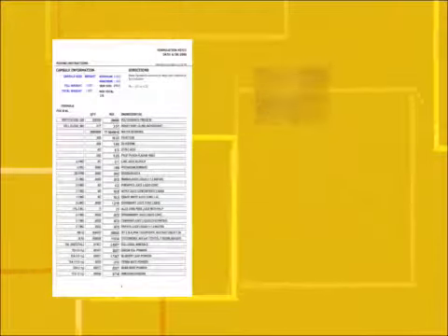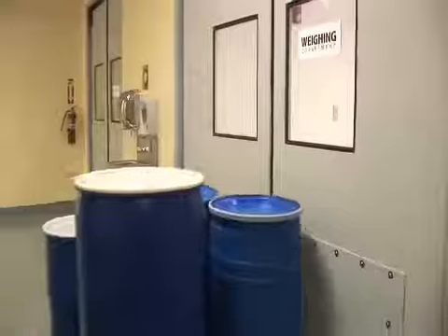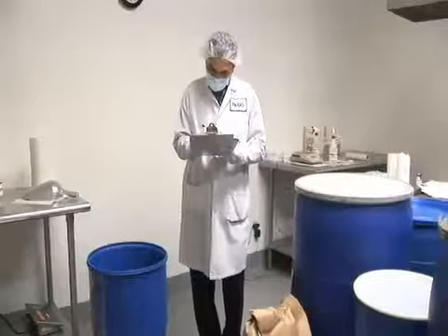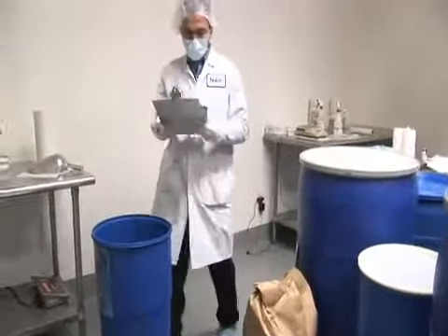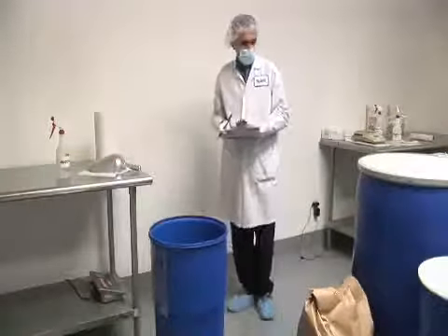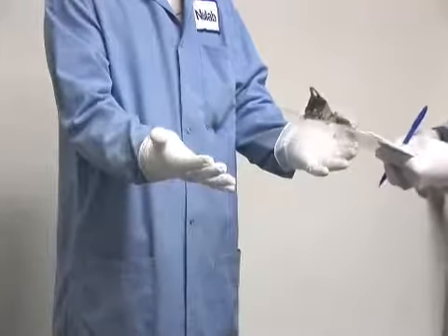To manufacture the product, the production manager issues a batch production order. This computerized printout gives the step-by-step instructions to make that formula. From the warehouse, the raw materials now move to the weighing room. There, a quality control inspector checks that the raw materials are from approved lots. The inspector then looks at the physical aspects of the weighing space. Is it clean? Has the equipment been sterilized? Are operators wearing their protective covers? The inspector goes through a checklist that leaves nothing to chance.